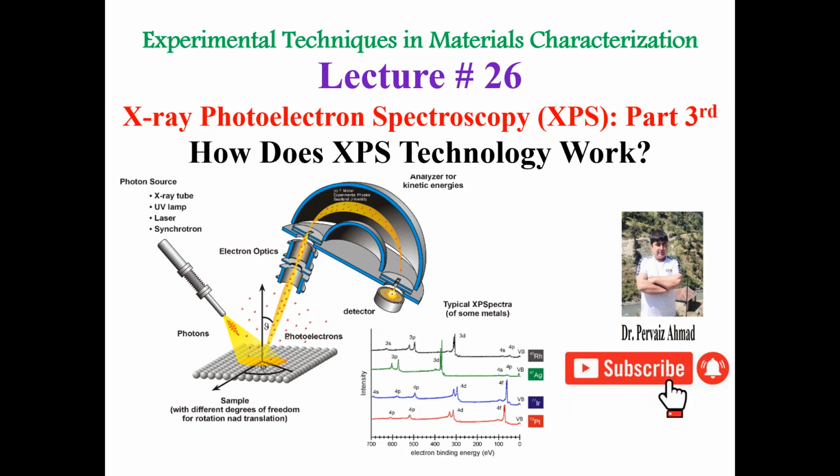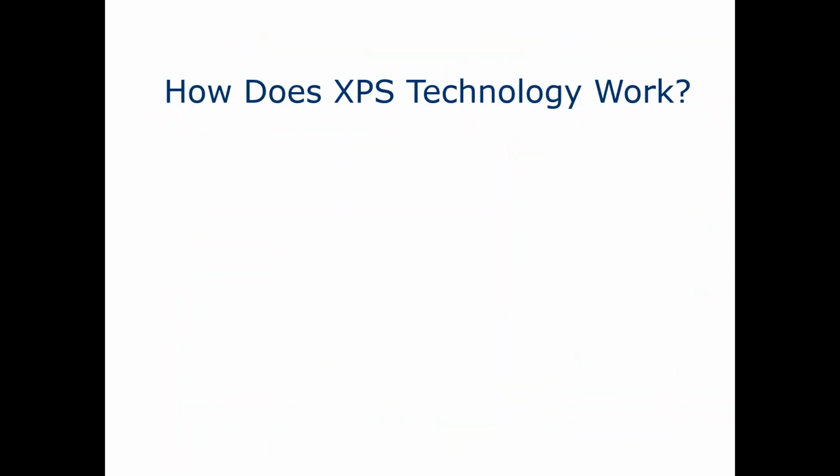This is part three. In these lectures, we will discuss how XPS technology works. So let's proceed towards today's lecture. We will start our discussion from the question: how does XPS technology work?